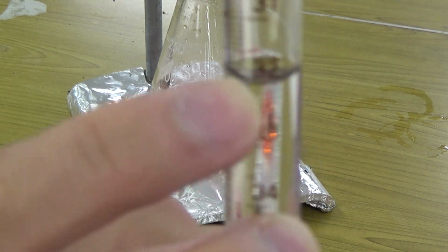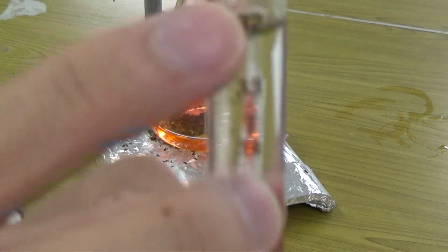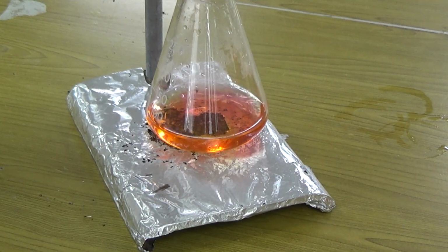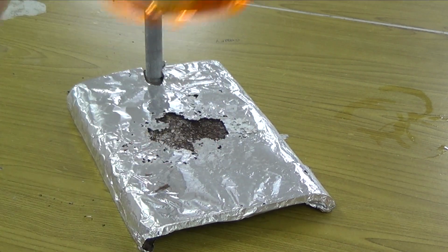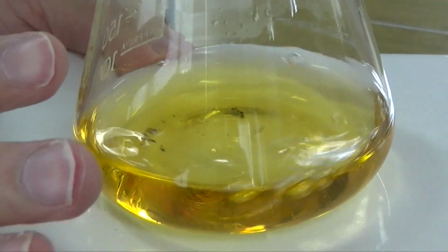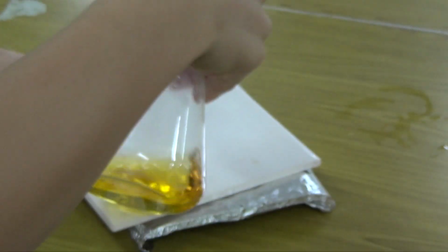Not too sure how well you can read that, because there's 33, there's 32.0. And we know there's no endpoint yet. You see that this goes a bit yellowy, well, I mean orangey, kind of reddish. But now it's gone back to yellow, because it's still not the endpoint yet.